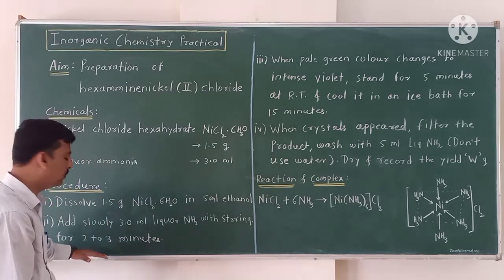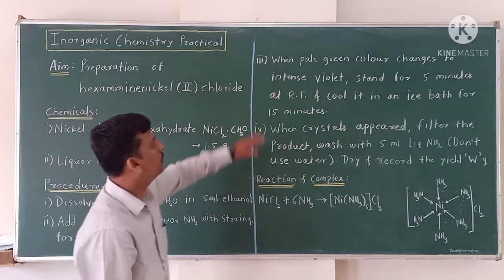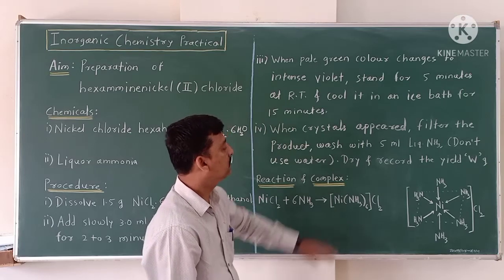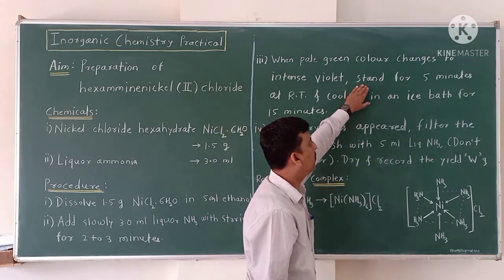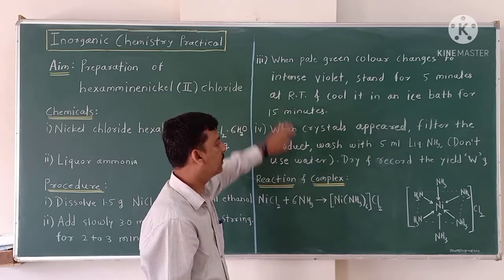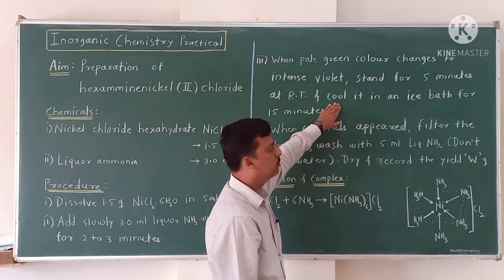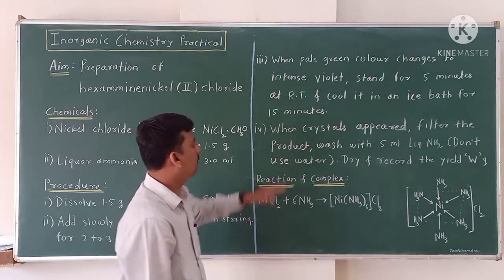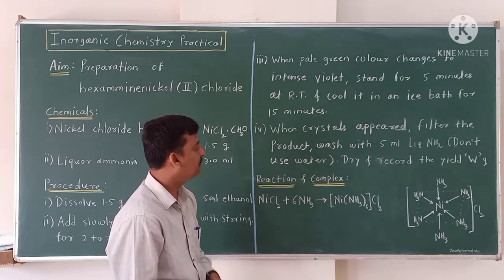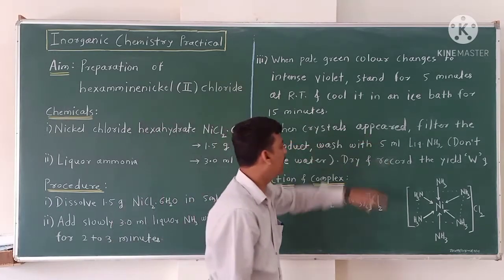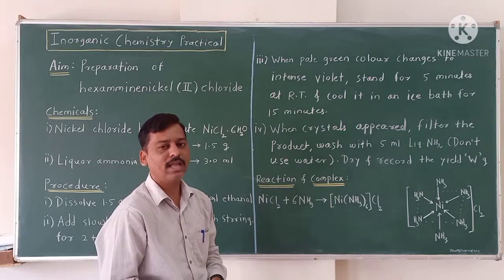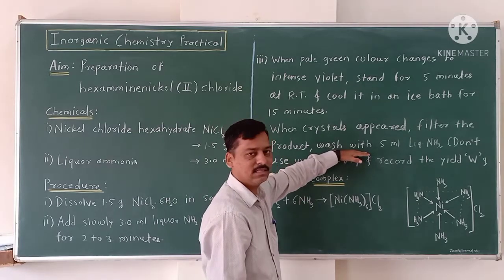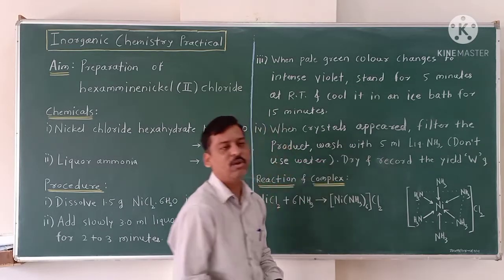After addition with constant stirring, keep for two to three minutes. When the pale green color changes to an intense violet color, stand the solution for five minutes at room temperature. Now cool this solution in an ice bath for 15 minutes. When crystals appear, filter the product. If crystals are not appearing, scratch by means of a glass rod and wash your crystals with a small volume of liquor ammonia.